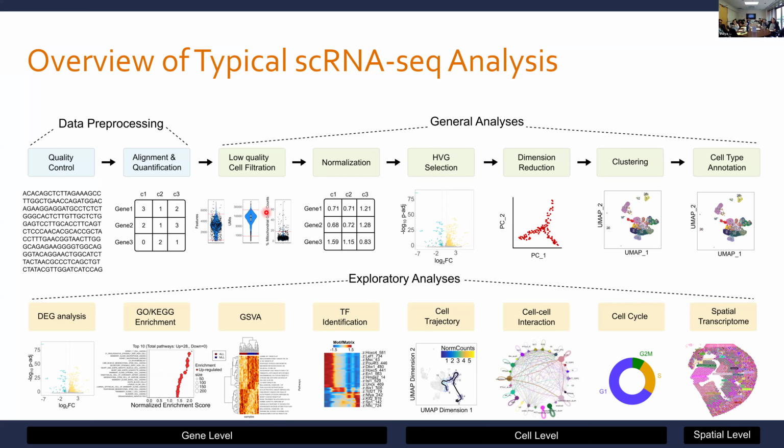But if you know your cells of interest have high energy requirements, then you would expect them to have a somewhat higher than normal mitochondrial DNA content, so you don't want to drop those out. So you have to create thresholds for where you make your splits for what's good and bad, using some of your own knowledge on what you're expecting to see.